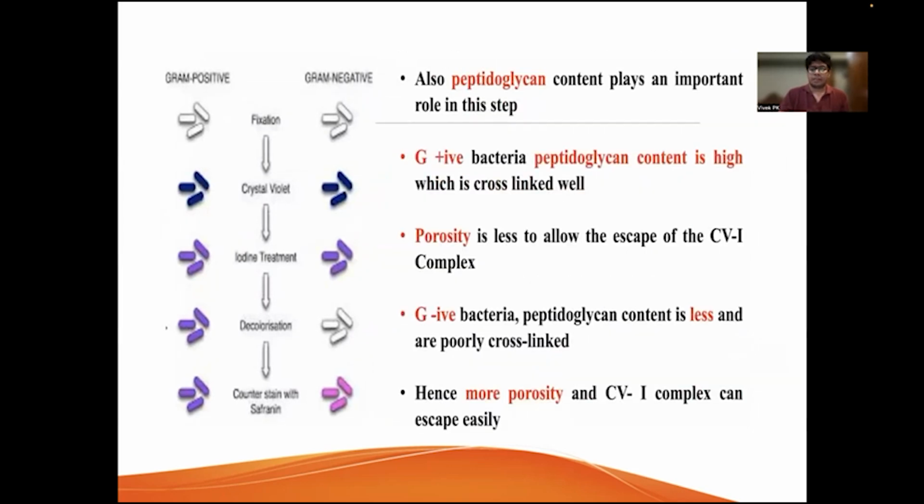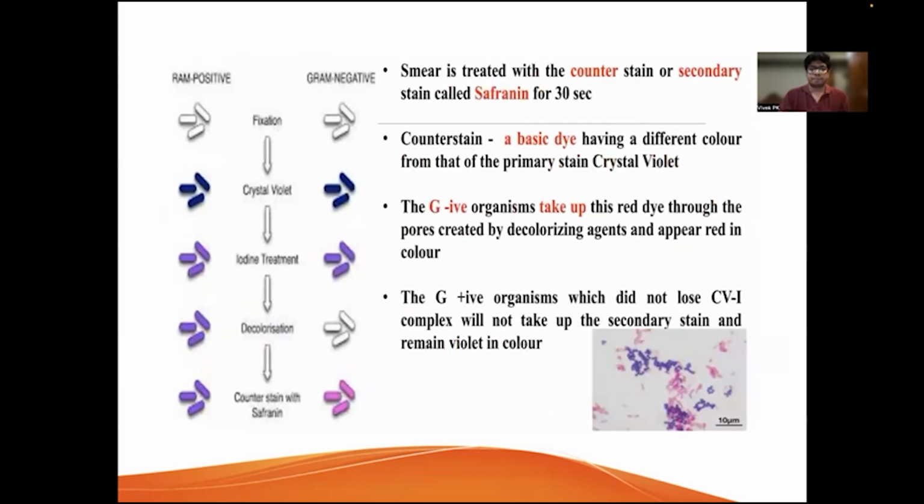And after this stage, we will add safranin. It is a secondary stain. So safranin is a counterstain. We add it after adding the decolorizing agent. At this stage, we treat the smear with the counterstain, the secondary stain called safranin, and we will wait for 30 seconds.